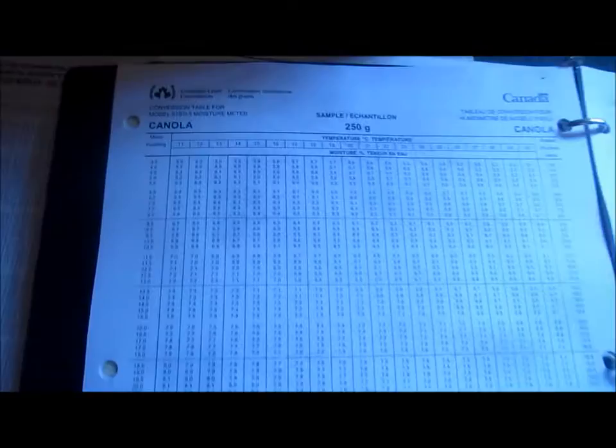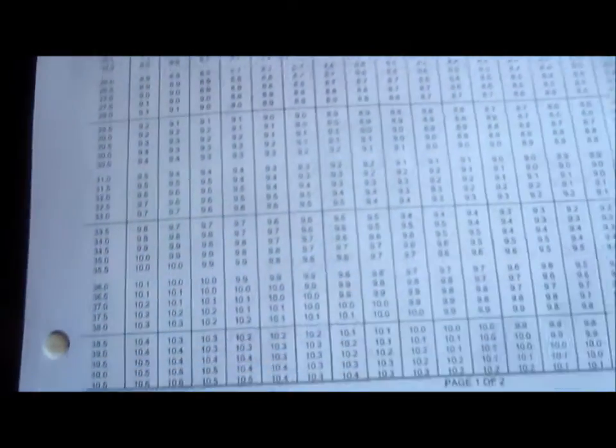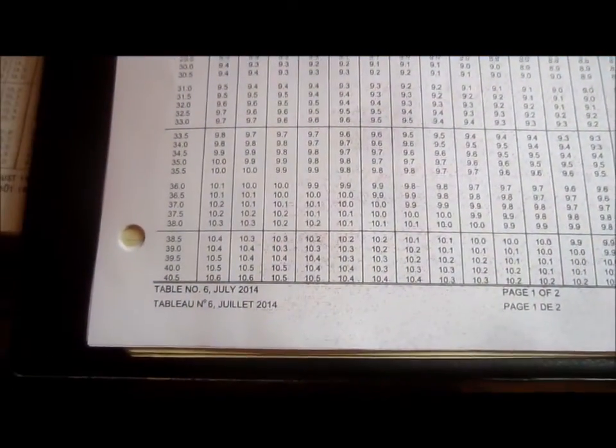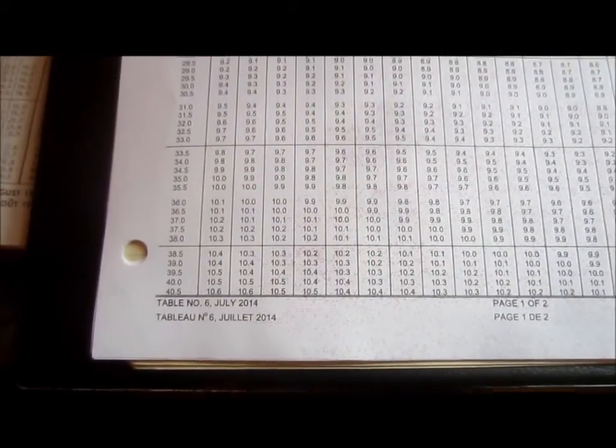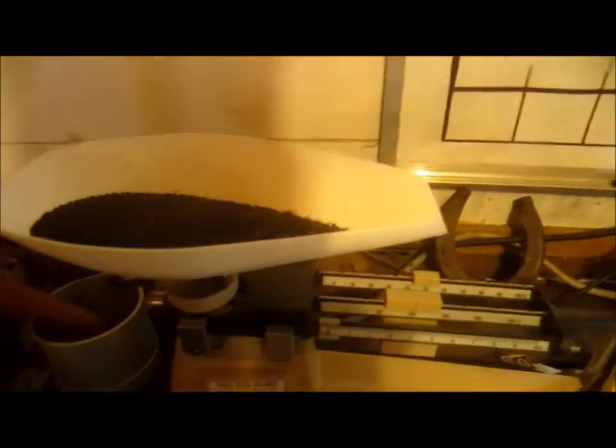These are the canola charts. It's relatively important to keep your charts updated — this one is, as far as I know, the latest, dated July 2014. New charts can be downloaded from the Canadian Grain Commission website, gc.grains.ca or something like that. The charts call for a 250 gram sample.